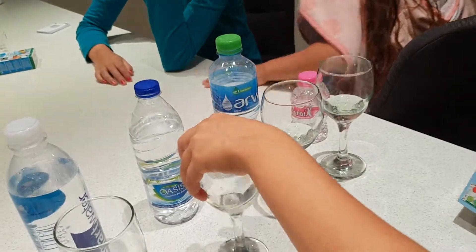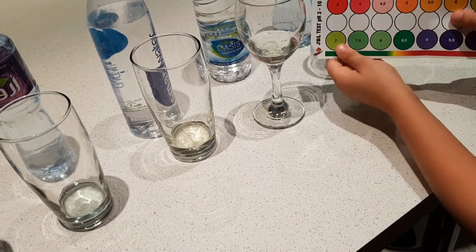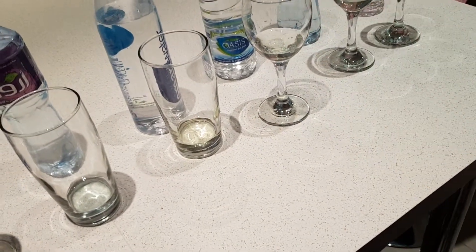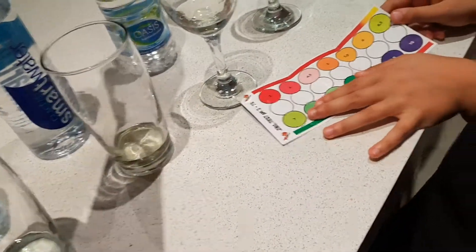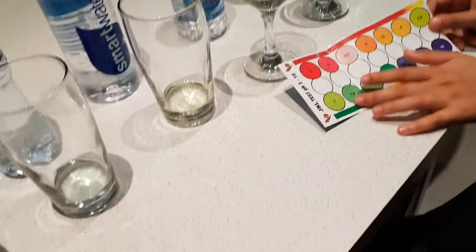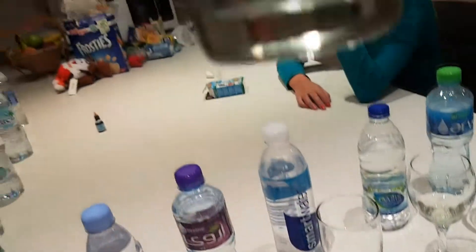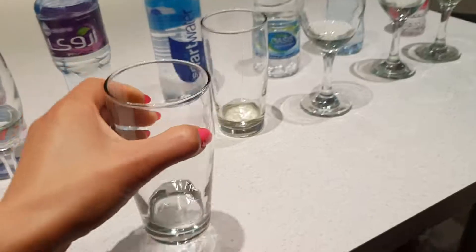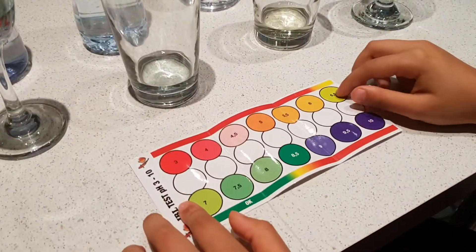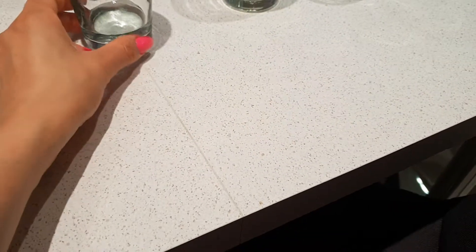Oasis — okay, so what were we aiming for here? This is more deep green. That means alkaline. That's blue — that means eight point five.